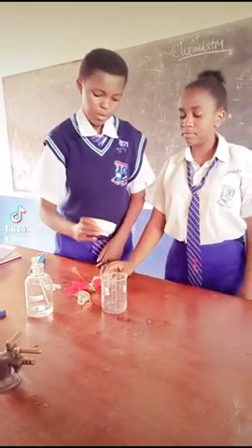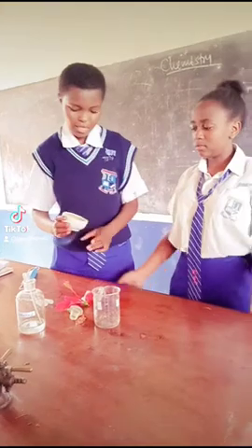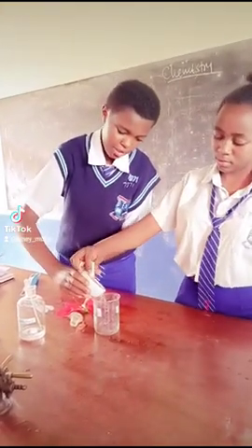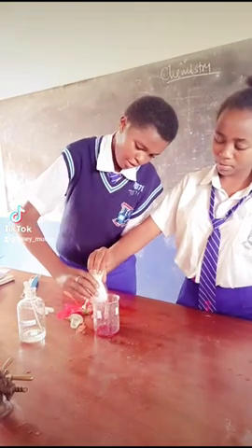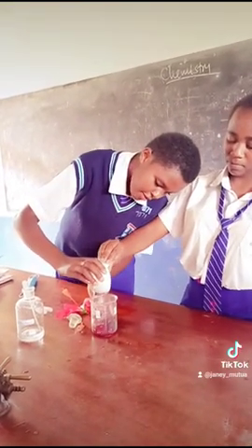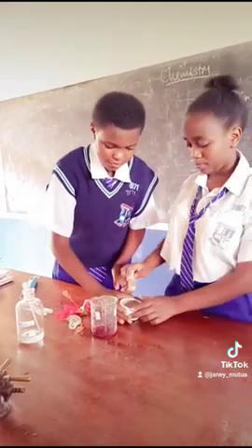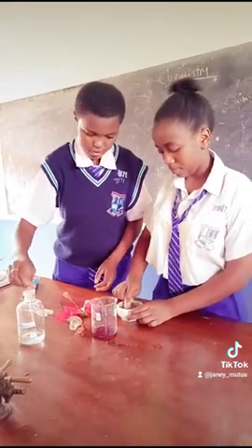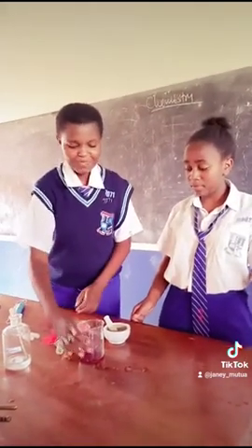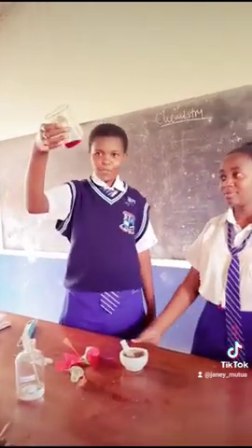So the next thing we are going to do is that we are going to decant this mixture into a beaker. Now this is the colour of our mixture.